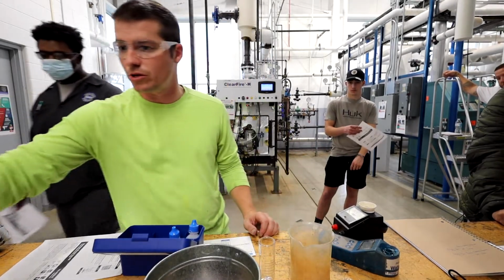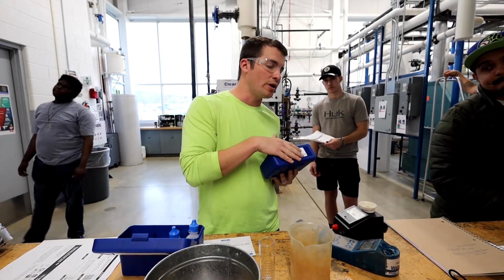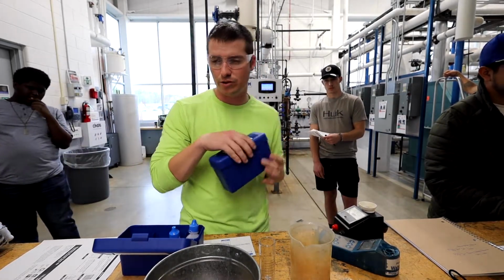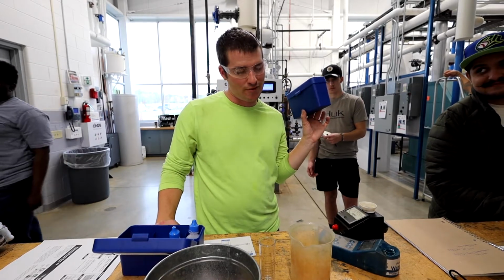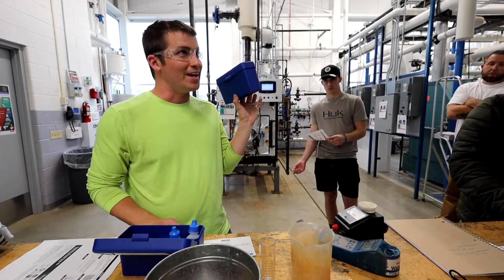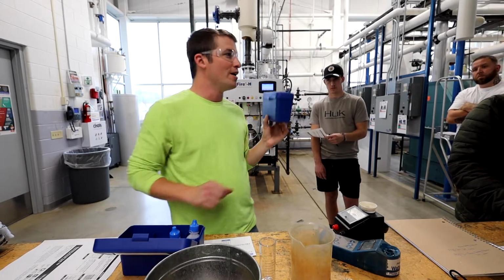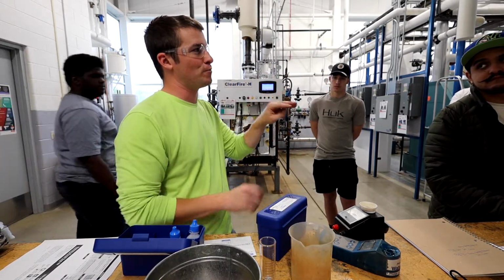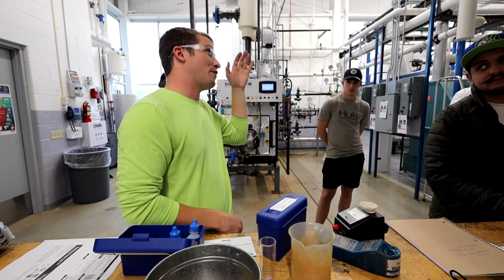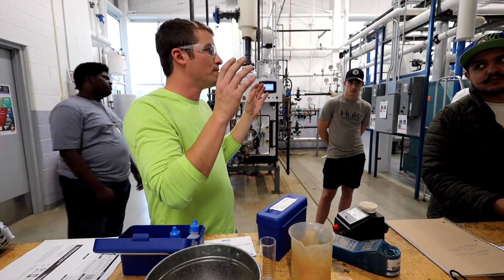So another test that's always good to run in your feed water is alkalinity. We're not gonna run alkalinity in your feed water today because, again, we're not really gonna do anything to impact that. We will run that in the boiler. And this is confusing. So I also don't have operators do this a lot, not that I'm smart and you're not smart. It's just, unless you do it a lot, it's confusing, right? Alkalinity can be in 3 different forms: O, P, and M. Which one do you want in your boiler? You want more O. How do we get O? We have to figure out the P, multiply it by 2, and subtract the M, and it gives you your O. So it's a bit more work, that's all?